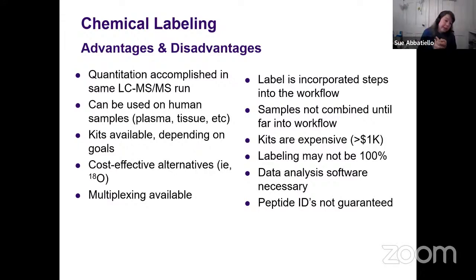If you don't fractionate and you detect all the peptides and proteins that you may have a hypothesis for, awesome, then you don't have to fractionate. Some people will fractionate into 8 or 12 or 96 and then maybe back off the fractionation level once they figure out what they need to see in their sample or make biological relevance of it.